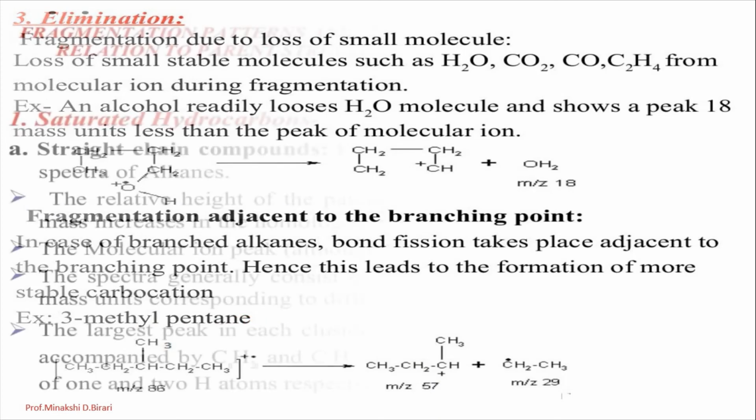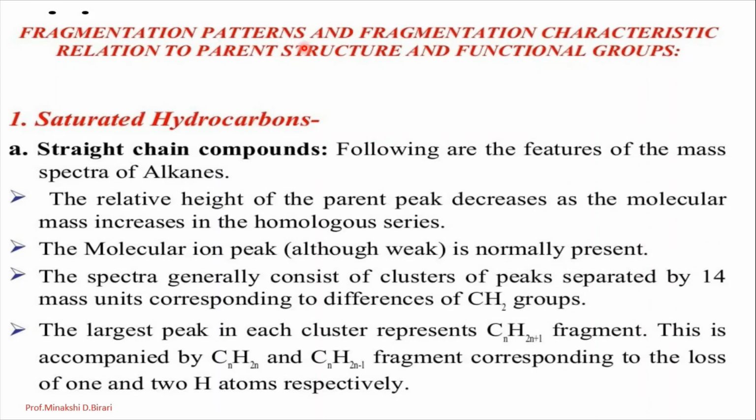Now, the fragmentation patterns and fragmentation characteristics in relation to the parent structure and functional groups. One by one, we will see. First of all, saturated hydrocarbons. In straight chain compounds like alkanes, what are the rules if you observe the mass spectra? First, the relative height of the parent peak decreases as the molecular mass increases in the homologous series.